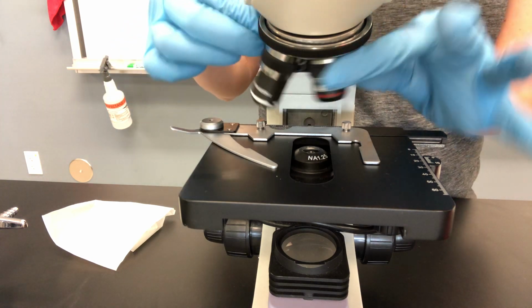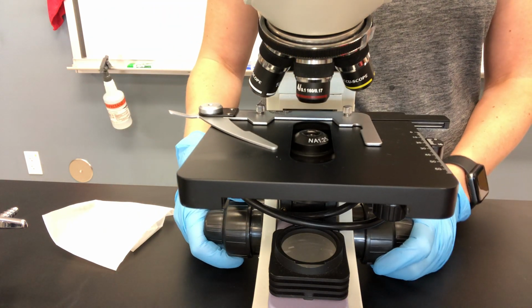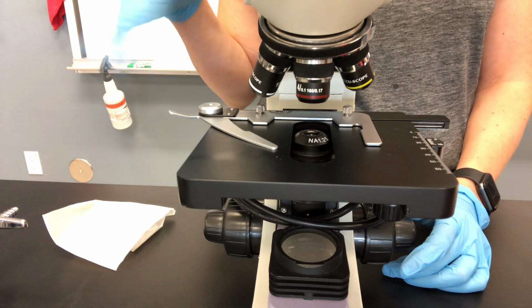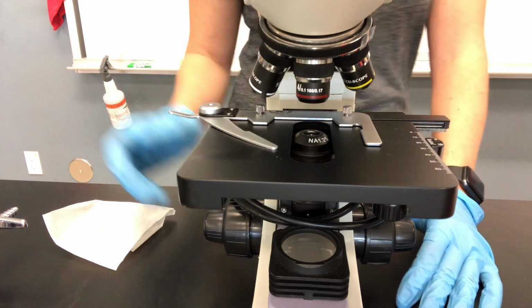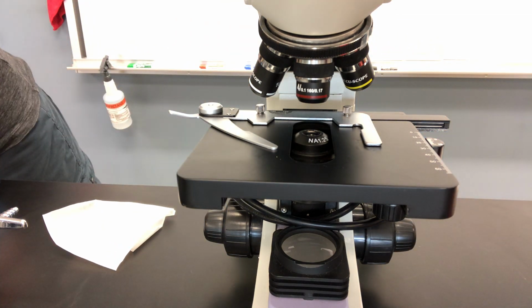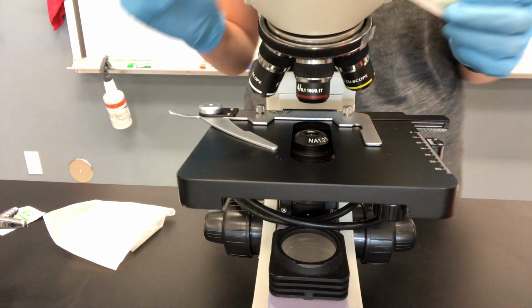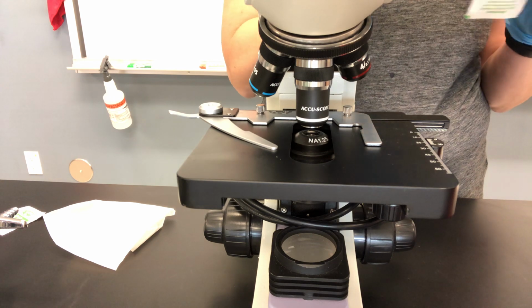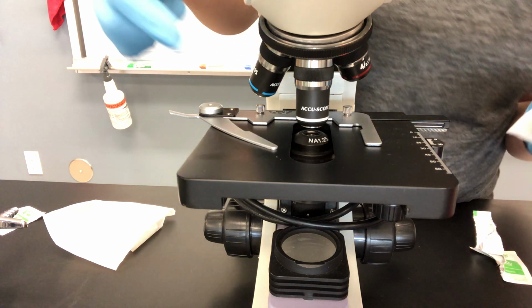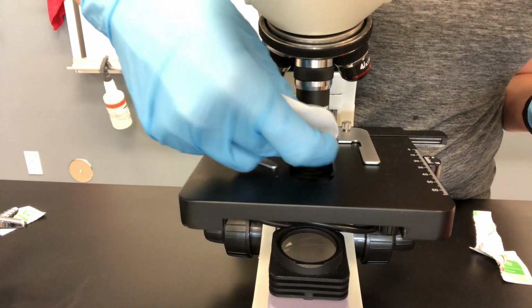You can go ahead and go back to scanning, put the slide on there, start all the way up, move it down until you see it, and then go on up through the low, the high, and then the oil. When you're completely done for the day and you're ready to put your microscope away, you need to clean it with an alcohol swab. So the alcohol swabs only come in at the very end, right before you're ready to put everything away. So you have cleaned off all of the oil with your lens paper like this.